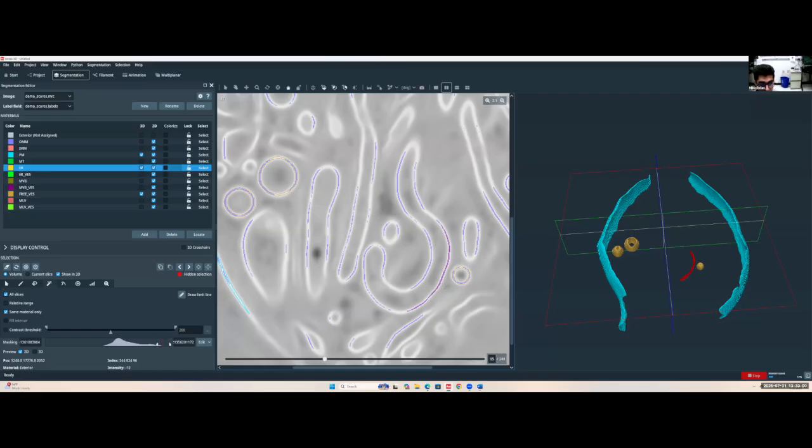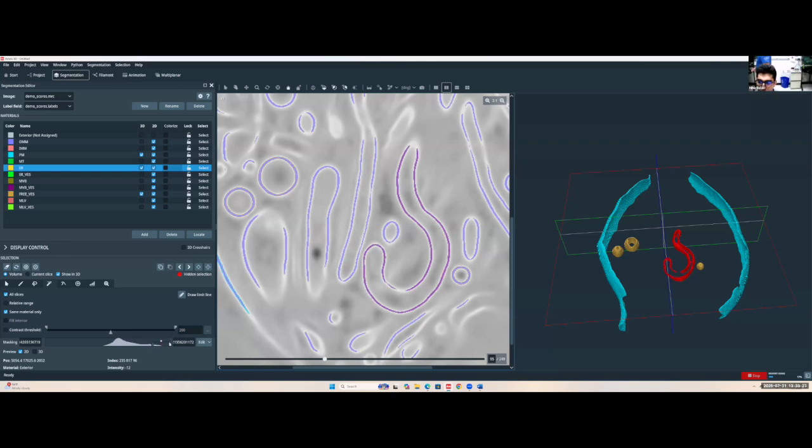So I've selected that piece and I'm now going to slowly adjust the masking. And we can see both in the 2D viewer, it starts to select more signal here by turning purple, but also in our 3D viewer it starts to pick up more. And I will continue to move my mask further and further until I feel happy with my volume. Whoa, so now I've seen it picked up too much.